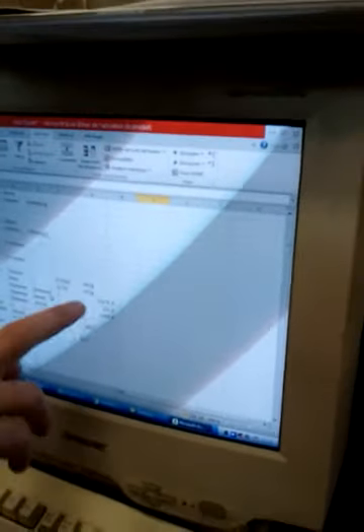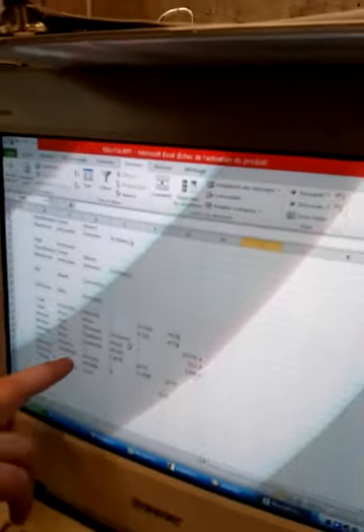Here, for example, we have total intrusion volume, 0.3 milliliter per gram. So it's approximately the porosity, and it can calculate here the porosity and the apparent density, the skeletal density have been calculated.